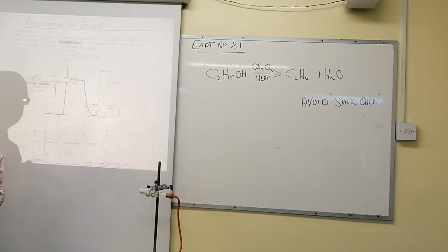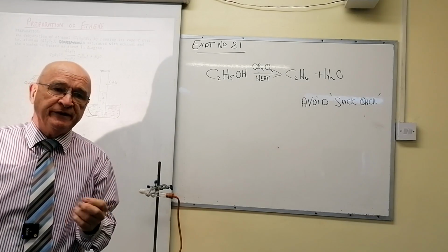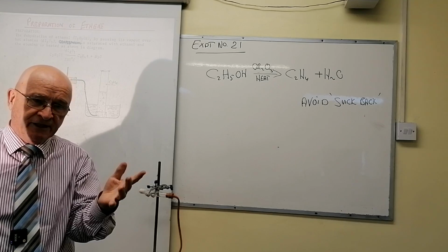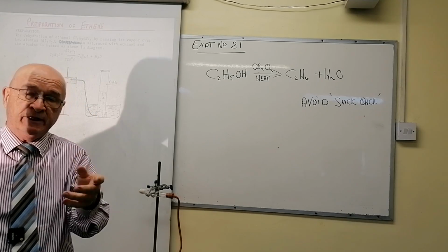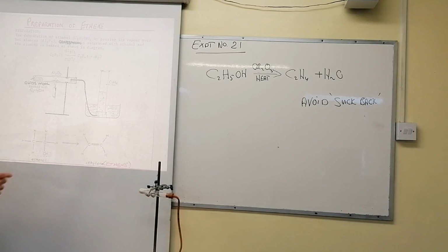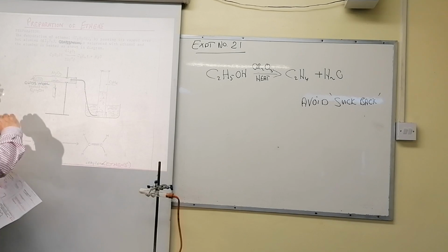The cold water hits the hot glass and it will crack. Very dangerous. You could get the gas to catch fire, and that would be all sorts of issues for you. You wear eye protection, by the way, when you're doing this. Sometimes I would say you're exaggerating the protection you take, but you need to take care at all times, okay? That you would have eye protection, that you'd avoid suckback, and that you heat gently, so you get a steady supply of gas, not a sudden rush of it.